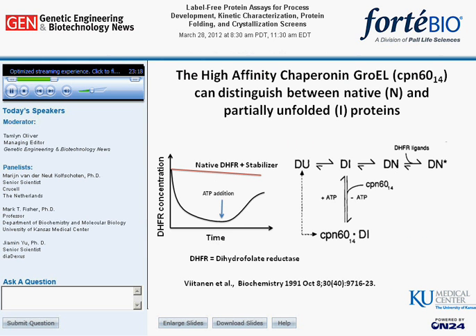This binding was reversed when ATP is added. The seminal observation that is pertinent to my presentation today is that the DHFR binding reaction onto the chaperone can be prevented when stabilizing ligands are present. This early experiment is the basis for our expanded use of the chaperone system, where we will use this system to identify protein ligands that bind to a target protein, thus shifting the dynamic equilibrium toward the native stable fold. Next.